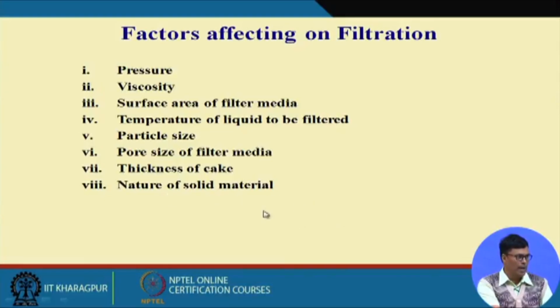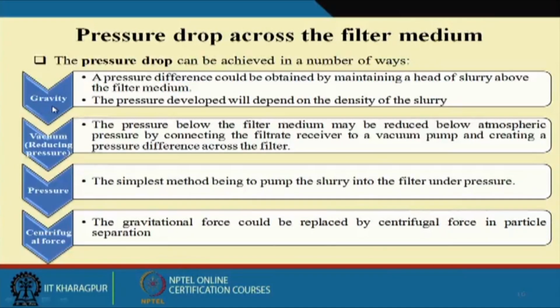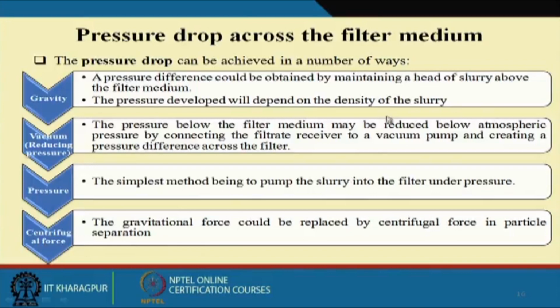So different factors affect the filtration process. The pressure drop across the filter depends on gravity, vacuum, pressure, and centrifugal force.